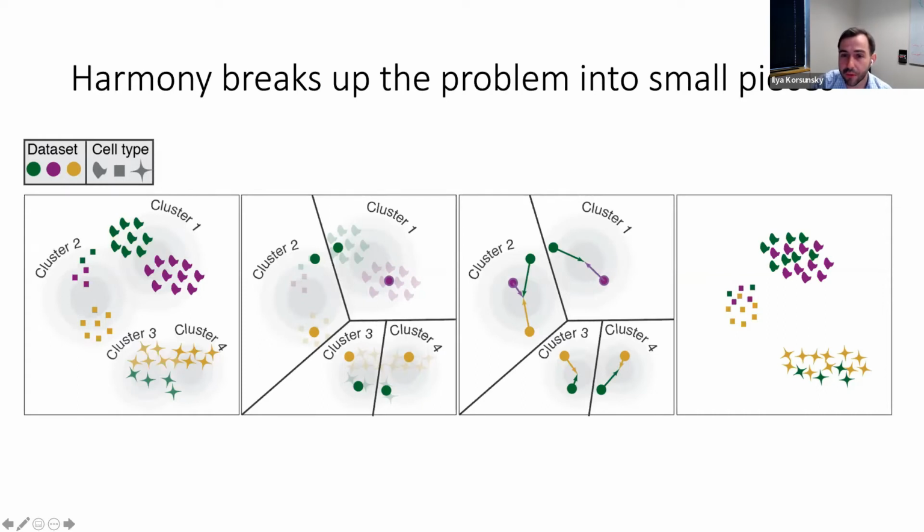Okay. Wigwo asks, cell subtypes are usually very close to one another. That's when it's difficult, for sure. What is the impact of the harmony procedure on subtype distribution or classification later? How do you reduce potential artifacts for subpopulations? Okay, yeah, that's tricky, right?